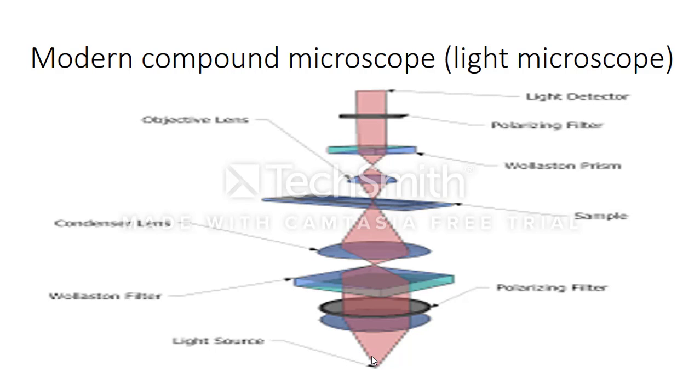So in order to increase this resolution with this apparatus, we can have a lower wavelength, and we can also have a higher numerical aperture, which is broken up into a refractive index of medium between the specimen and the objective lens.